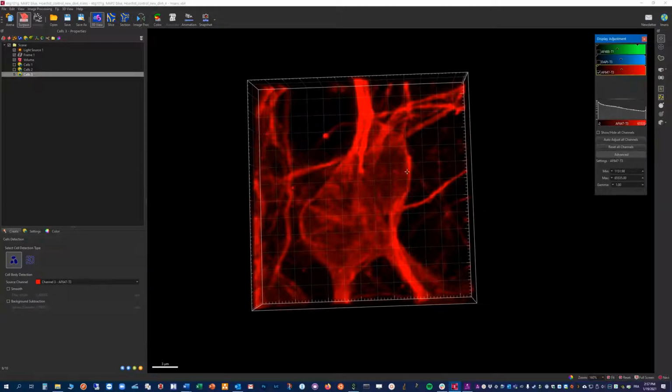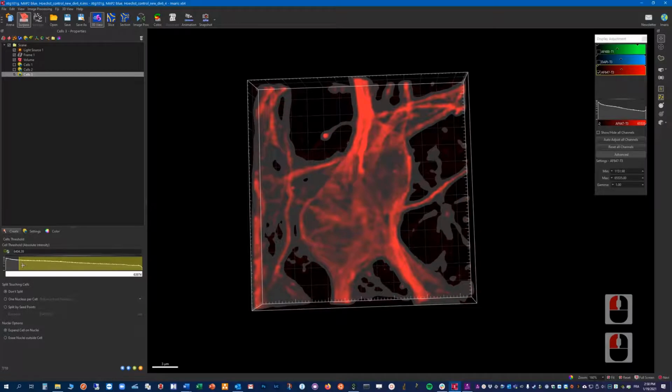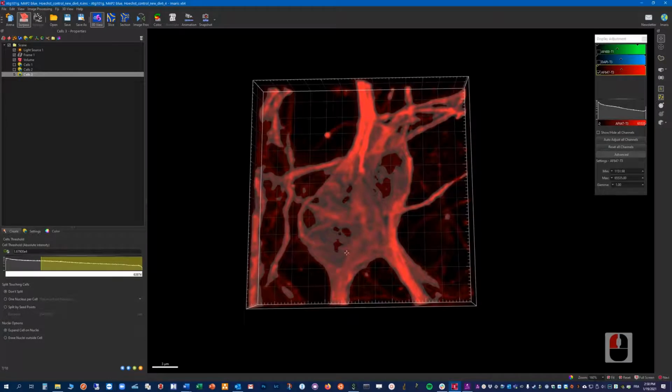here the problem we have is that we have very well defined filaments, but now the central part of the cells is looking very hollow. So if we smooth the signal as before and proceed here, we can be a bit more restrictive, but then we'll start to see holes inside our cells.